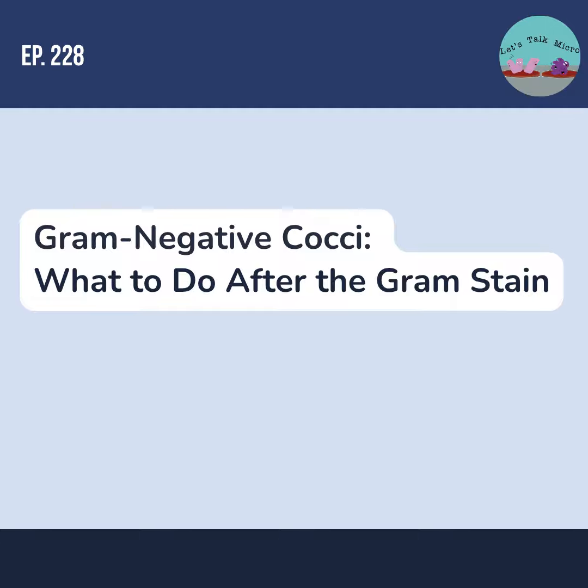And that is the goal of this series: to reinforce those concepts so even students and those of us that already work in the field at the bench can become a little bit stronger, so we are able to rule some things in, rule some things out, and be more comfortable when we're working in the lab with gram negative cocci.